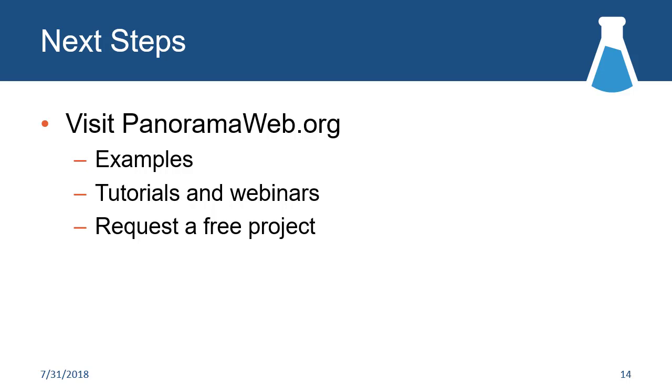So hopefully that gave you a little overview of the tools that are available. So I think next steps will be much more concrete as soon as Vigisha takes over. But Panorama Web is really where I recommend people explore and kick the tires. So you can see the data that's already there. There's an example project of just an assortment of different files that have been uploaded. There's also a lot of great data in Panorama Public, which is more curated and there's more context around it. And it's a place where you can upload your own data and start playing around with what that looks like in that full workflow.